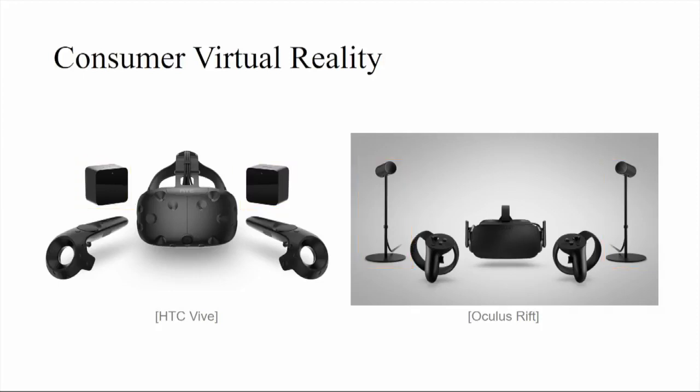And in this way, they're able to provide a direct 3D interaction and a 3D environment for you to kind of immerse yourself and work in, which makes them uniquely well-suited, we think, to performing tasks that require direct 3D interaction.